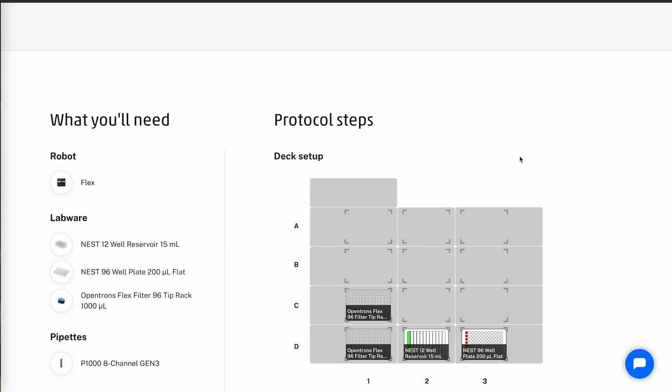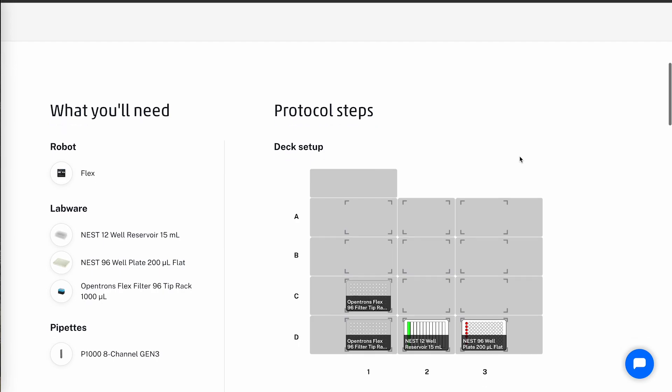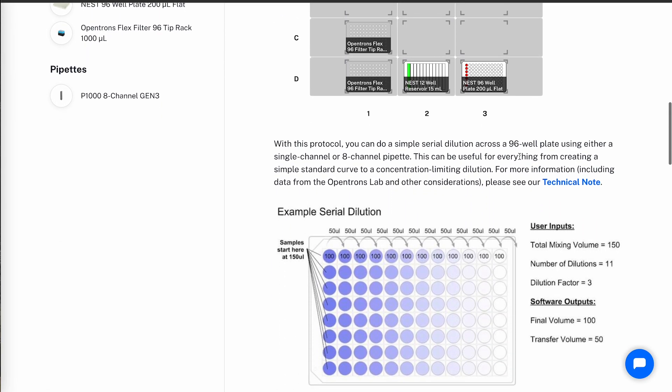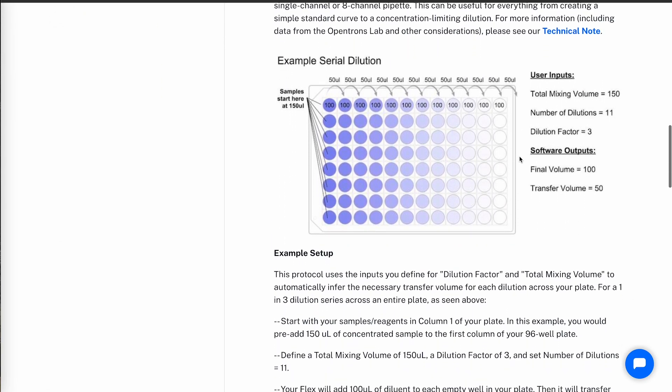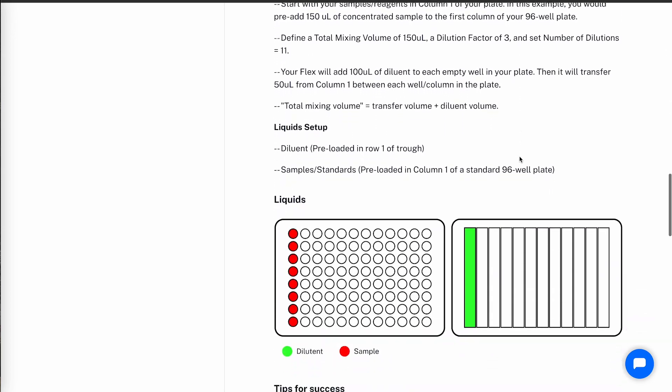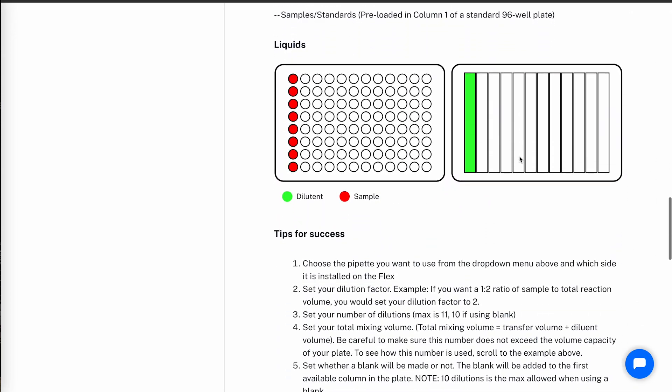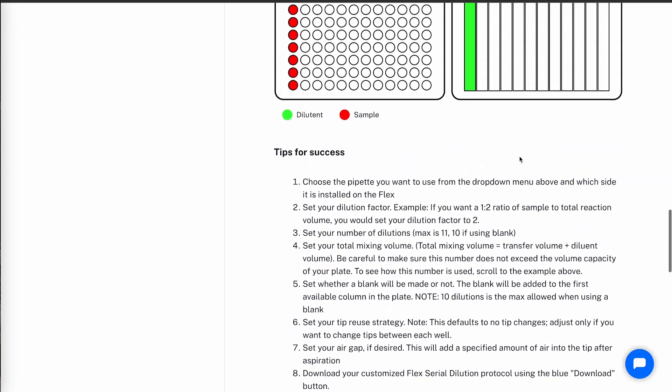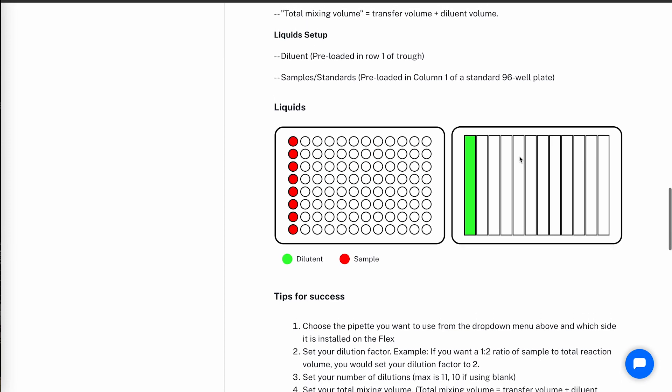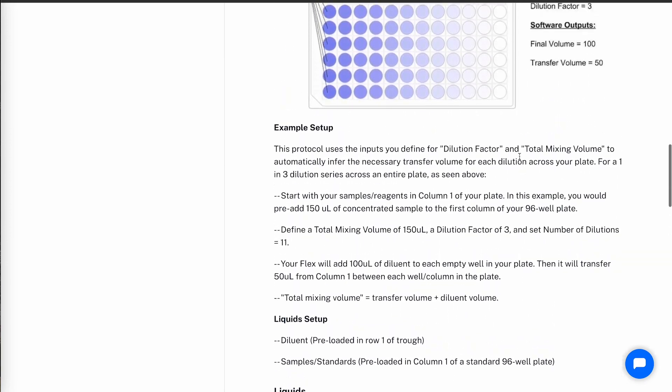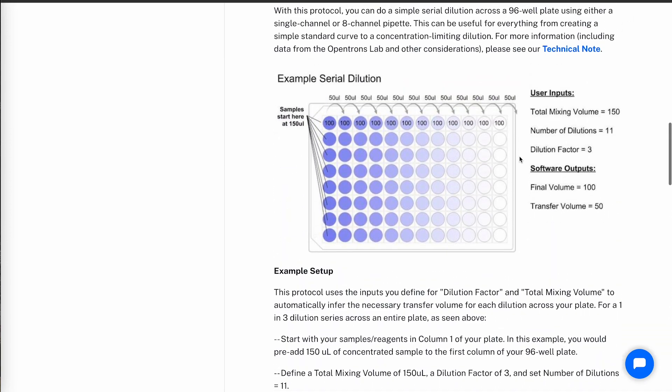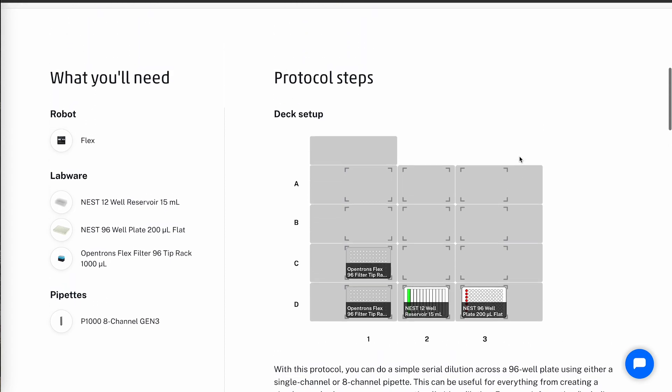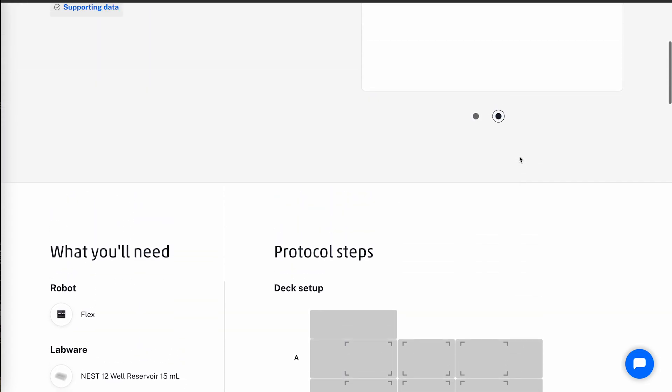Under the protocol steps section, we have detailed information on protocol steps, guide to setting up the protocol, and tips for success with the protocol. Let's continue on with configuring this protocol and downloading it so we can run it on the Flex.